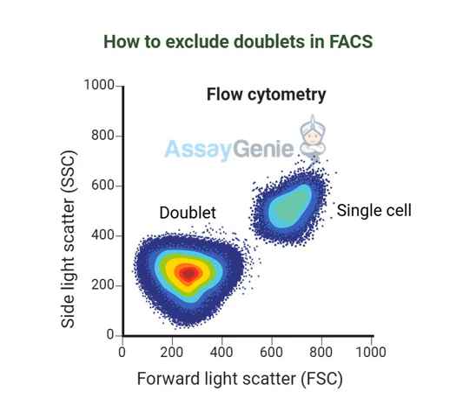Well, let's say the drug is actually working great, killing off cancer cells left and right. But because of those doublets pretending to be single cells, the data might show that fewer cells are being killed than there actually are. So it's like the doublets are messing up the numbers, making the drug look less effective than it really is. Exactly. They're throwing off the whole count, and that could mean that a good treatment gets ignored or even abandoned.